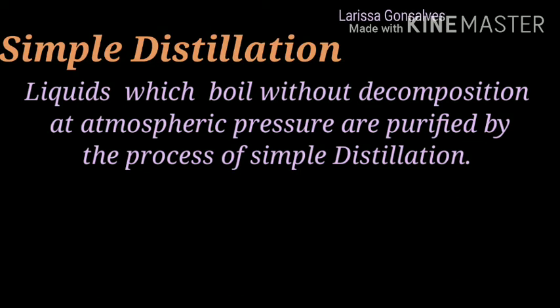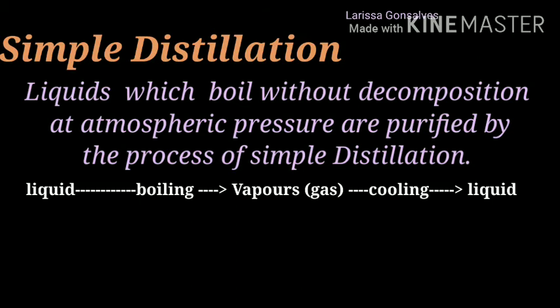In this process, the liquid is first converted into its vapors by boiling, and these vapors are again condensed by cooling, which means the gas has now converted into liquid, and then this pure liquid trickles down in the receiver.